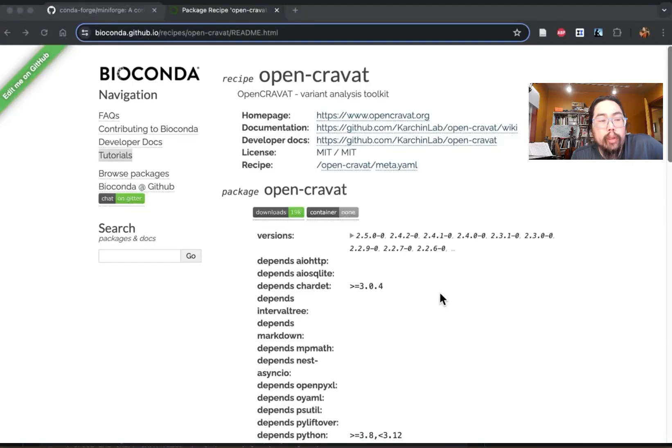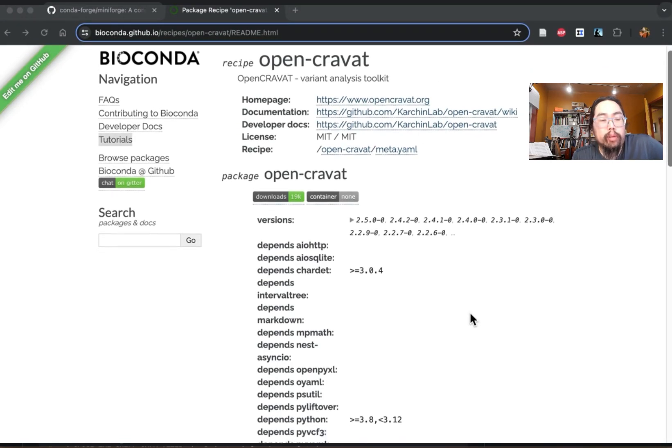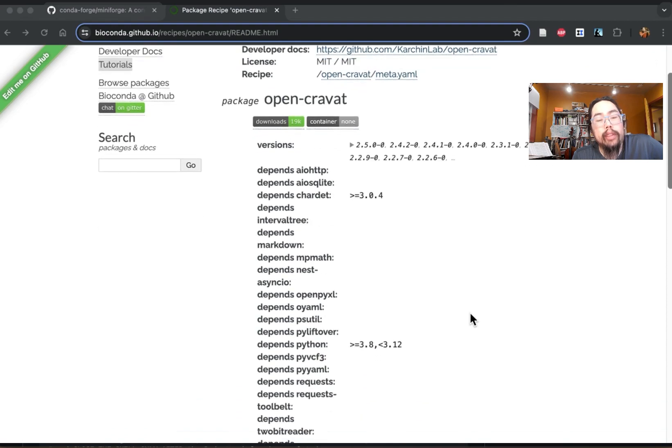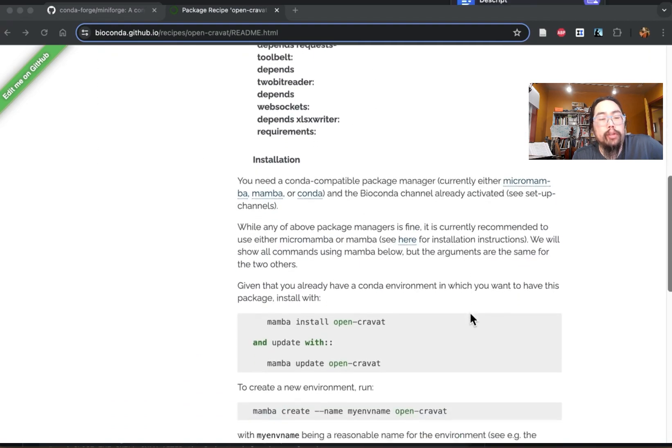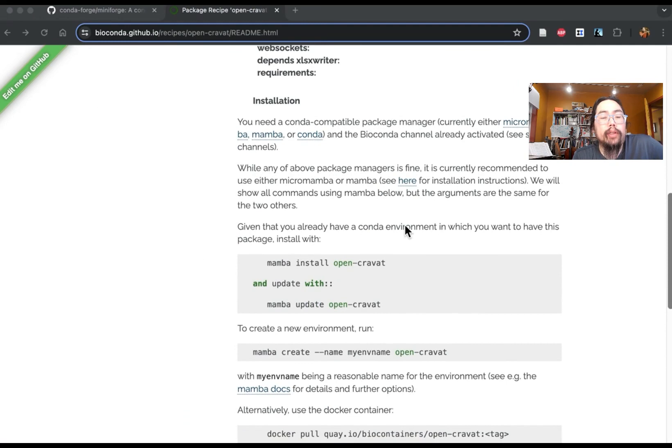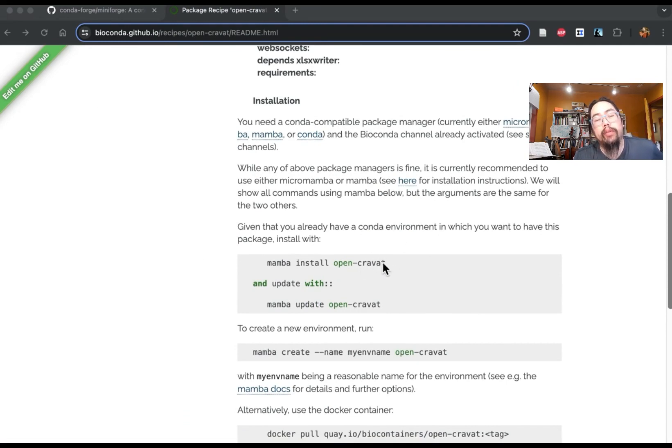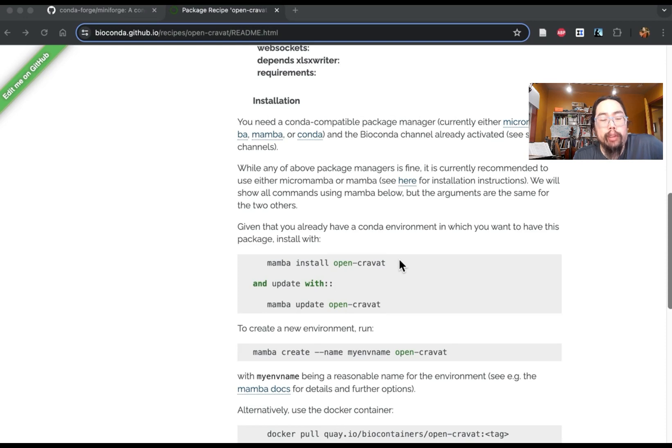So here we are at the Bioconda page, and you can see there's links to the OpenCRAVAT project here. But the thing that we're looking for is the installation instructions. So there are two options here. The first one assumes that you've already created an environment. And if you read the Mamba documentation, it suggests that you never install anything in the base environment. It's very strict about that.